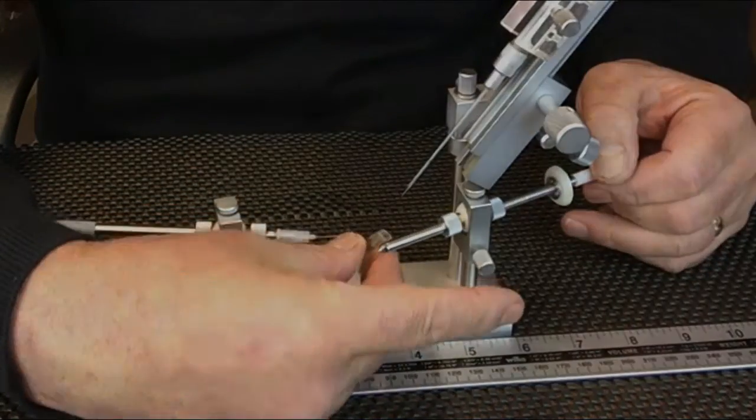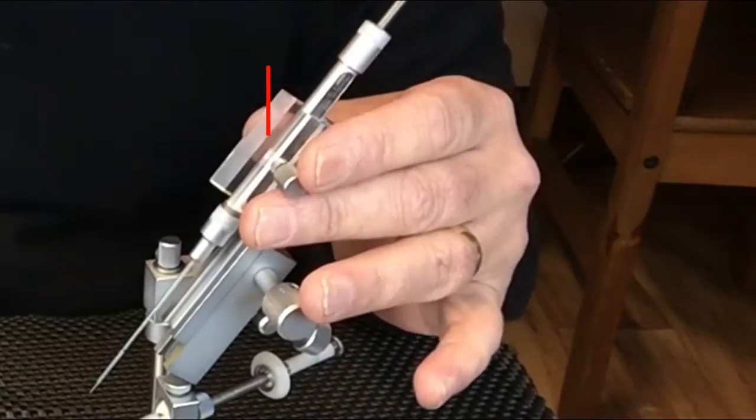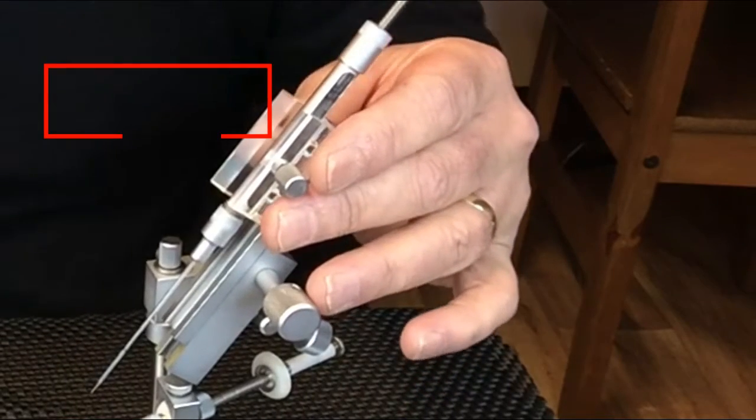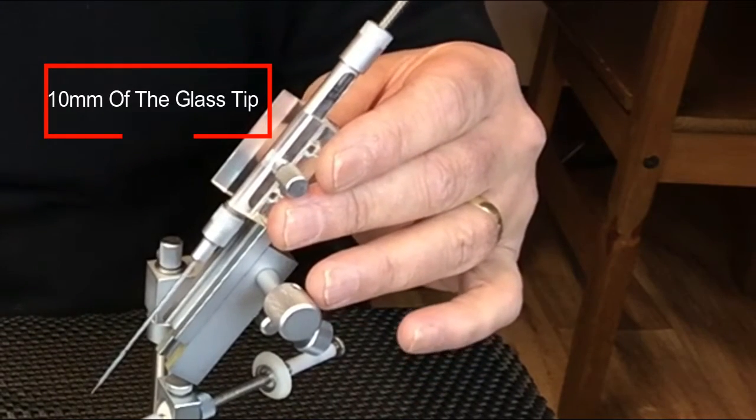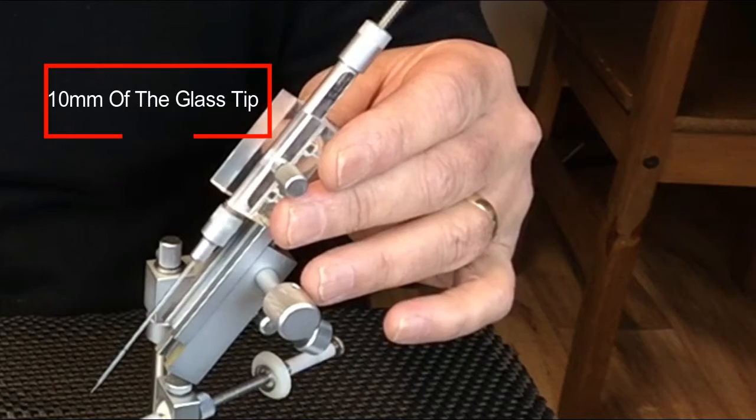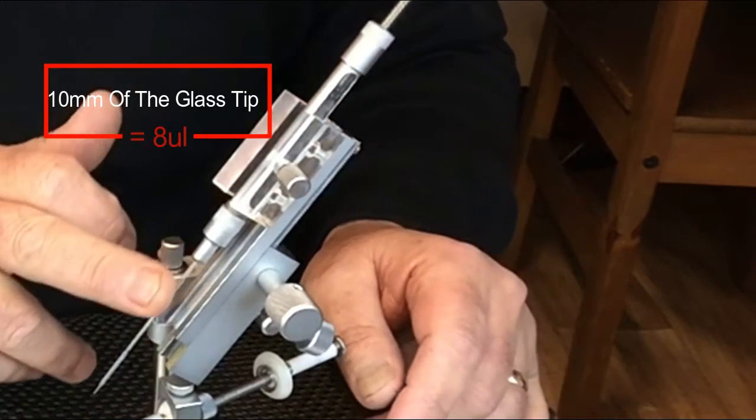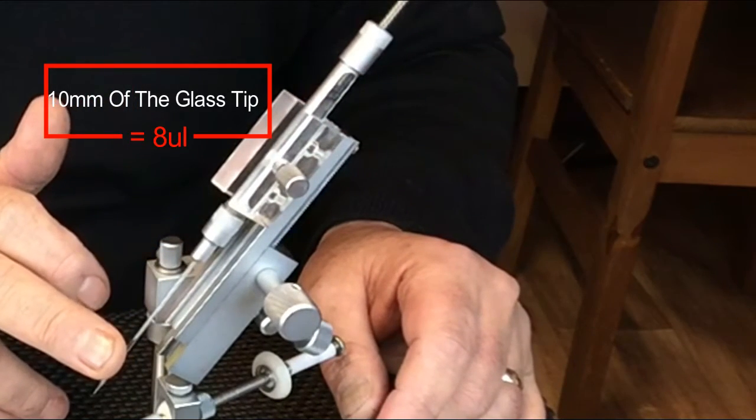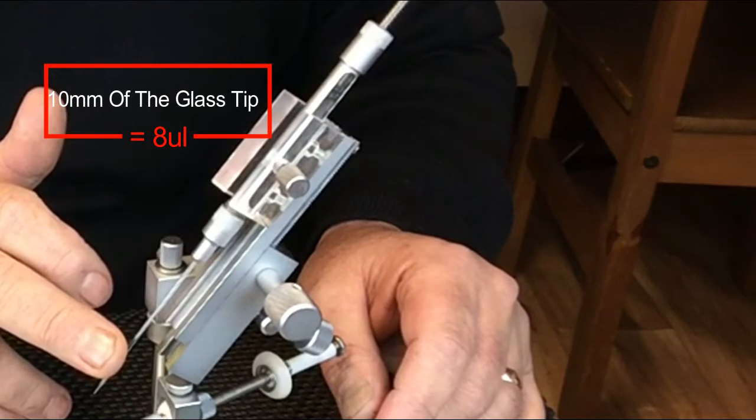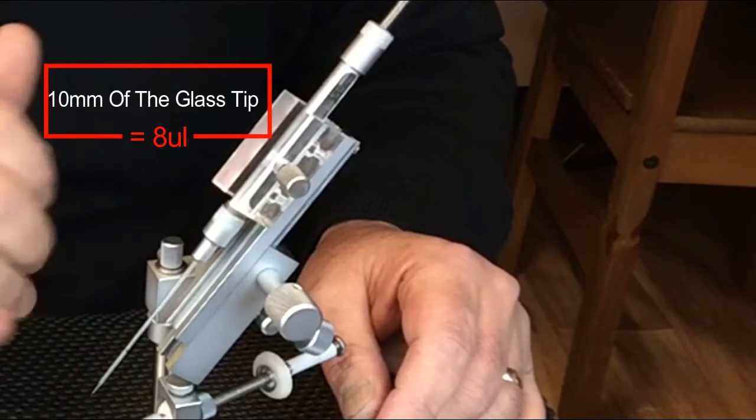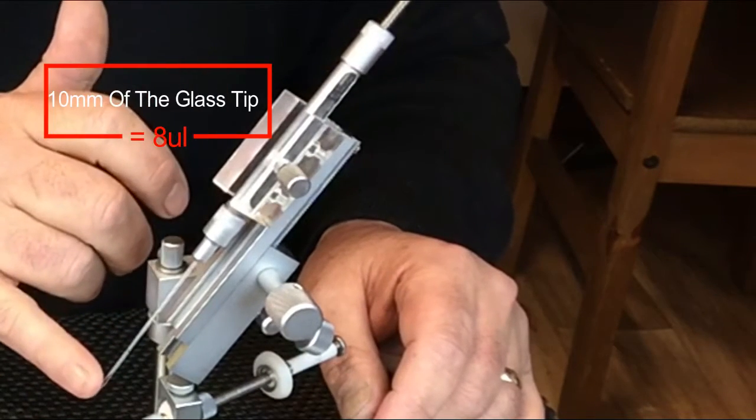This is a removable queen holder. The Schley standard syringe holds up to five sperm portions, each portion is eight microliters. In the glass tip this works out at 10 millimeters of the glass tip to each portion, or eight microliters of semen.